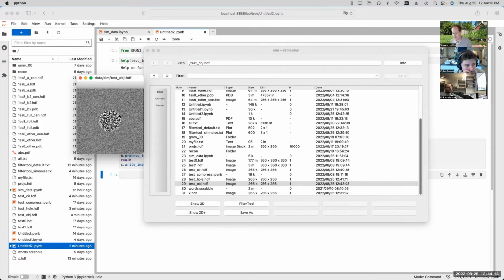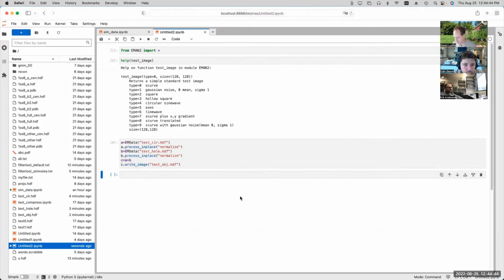I'm just explaining the sorts of issues that we're going to run into when you try and do this kind of simulation, right? You think you kind of have all your bases covered, and yet you run into these sorts of misnomers. Right. So typically what you do in a situation like this is either you're going to add this noise on top of this noise, and that's going to sort of mix in, and that's actually probably fairly realistic, or you may make some sort of heuristic adjustment to this. So let's try the first approach.